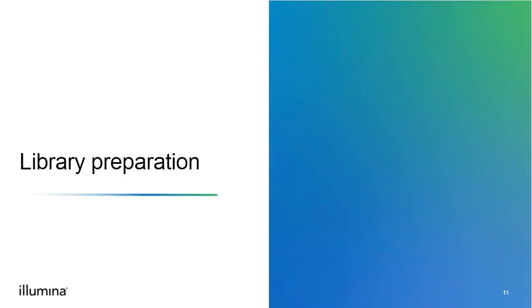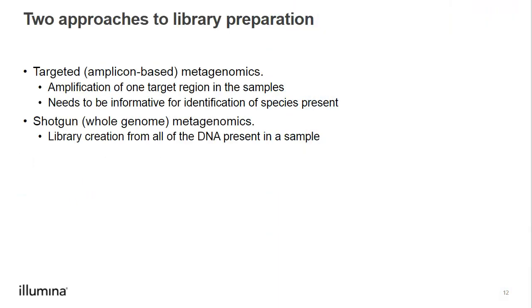So now that we have our DNA isolated from our samples, purified and quantified, let's proceed with library preparation. Library preparation of our DNA samples enables us to sequence the samples with an Illumina sequencing platform. For metagenomic sequencing, there are two main approaches to library preparation.